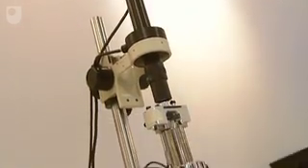The tip is the business end of an atomic force microscope. Different designs and compositions of tips enable AFMs to be used for a wide range of applications, from the electronics industry to cancer research.